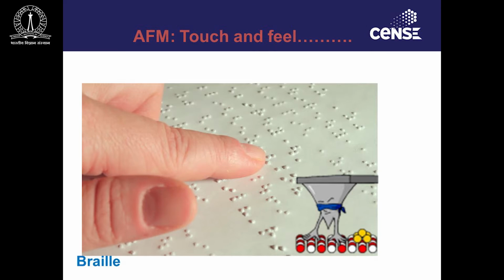There are different models of AFM that are possible. Generally, the AFM comes with the tube scanner. We can see it here, where either the XY stage is sitting on the tube scanner, or the Z and XY, all three, are sitting on the tube scanner. And they have their own issues, problems. Then there is another model called a decoupled model, where the XY scanner is different and the Z scanner is different, so this moves independently of this.